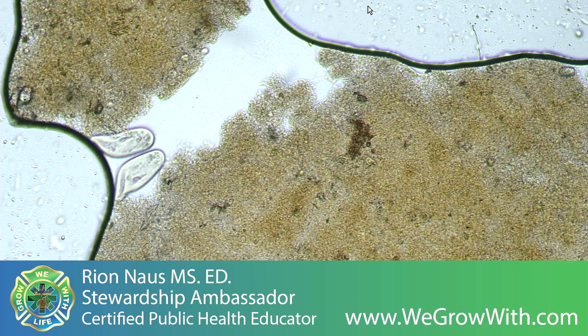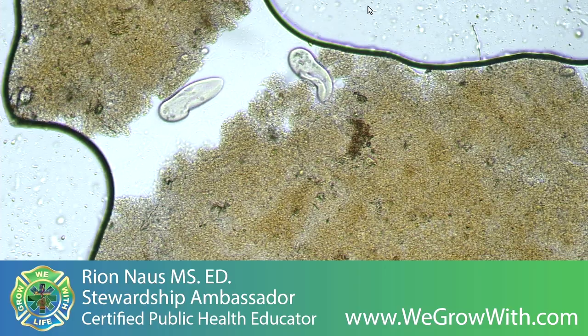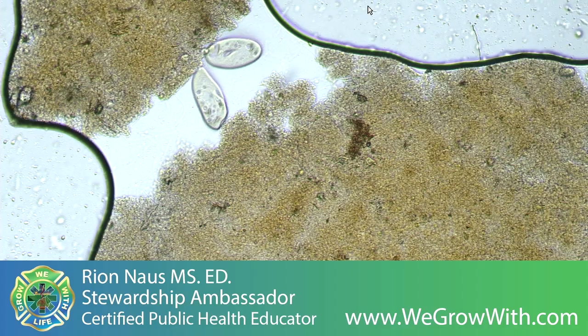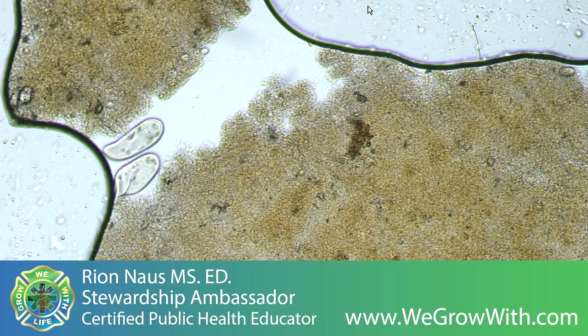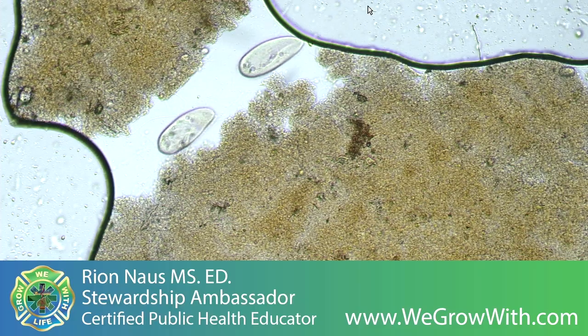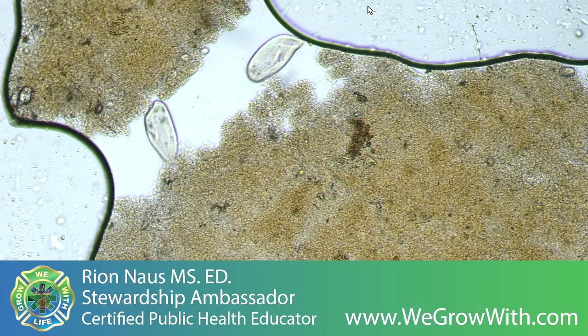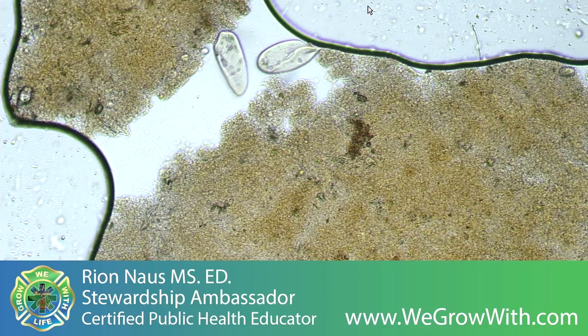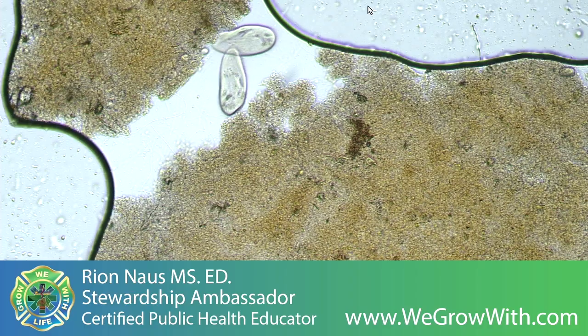When we talk about aggregates, we don't often have an opportunity to see aggregate formation. But capillary action can do that with pressure, and it's called bioturbation. Does that with the living part. Now that edge there, it really is just the surface tension of water. And as that slide dries out, that tension, oh, look at it push.